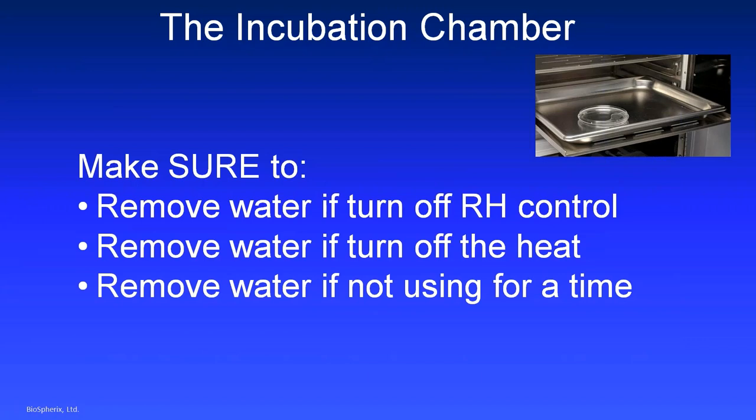We'll go through that in a minute. You want to make sure to remove that water from the incubation chamber if for any reason you need to turn off the RH control. I've seen it happen in labs where someone took the cells out of the incubation chamber and they left the water in there. They forgot about the water. And then a day later they see, oh, all the controls are still on for the incubation chamber. Well, I don't need that anymore because my cells are out of there. So I'll just turn off the controls there. And now there's still water left inside.